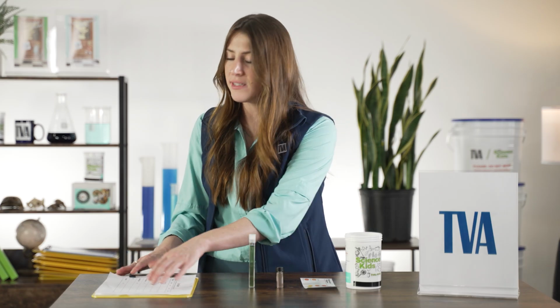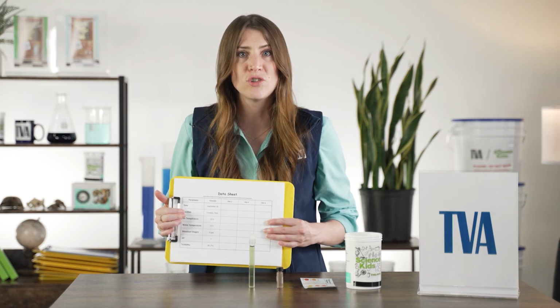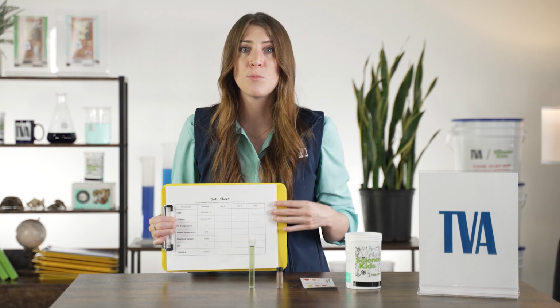What we want to know is, is there enough sunlight penetrating through so our aquatic animals can see to find food? And can our aquatic plants photosynthesize properly? If you determine yes, then it's within a normal range for your area. Take all the pieces that you've recorded and interpreted on your data sheet, and let's go back to that original question. Will your water source support aquatic life?